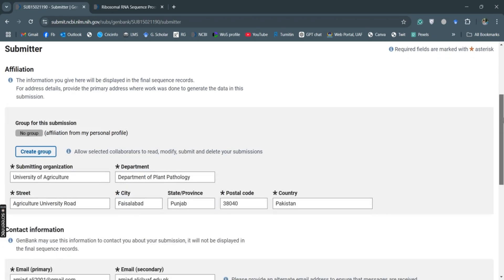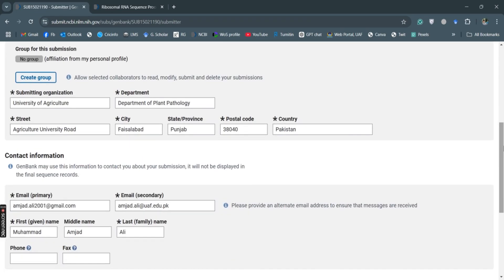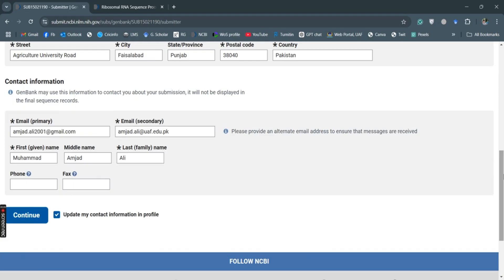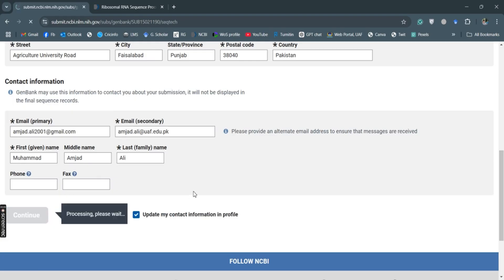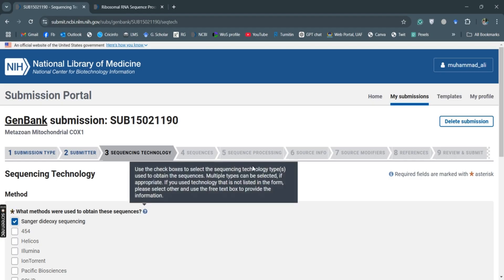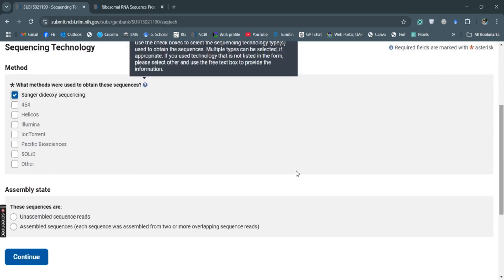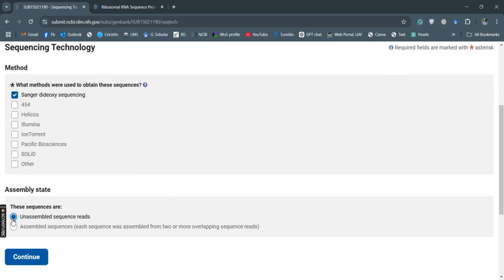Always submit the information of the submitter. My information is already added so I will continue. What kind of sequencing method we've used? Sanger sequencing, and these are unassembled sequences.